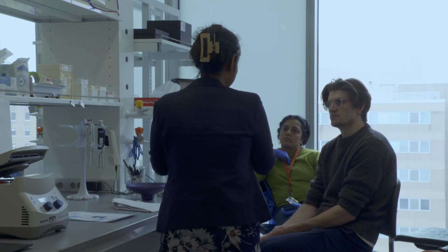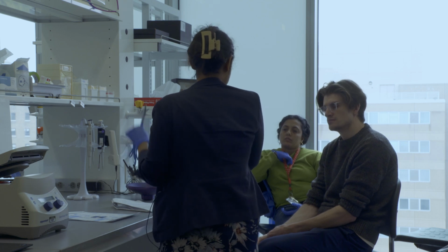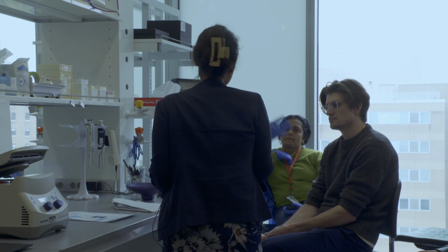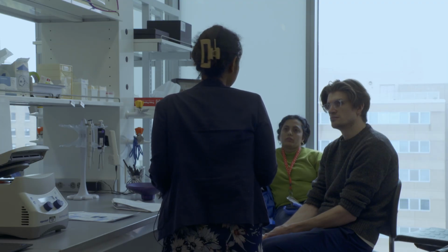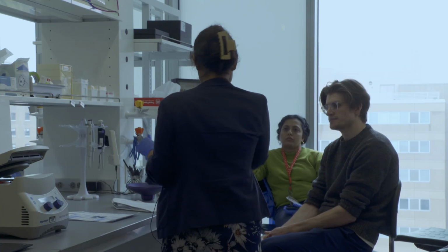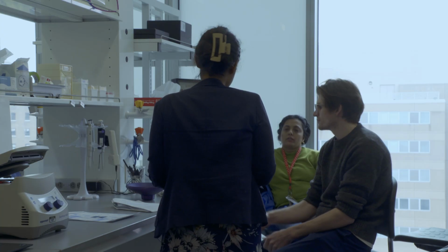Our target is to get more reads for whatever mononucleosome peak we have, right? So if the sample is clean, we don't need to calculate that way. But if the sample is not clean and you want to change the ratio based on that peak versus the gDNA, you can always do that. You know what I mean?